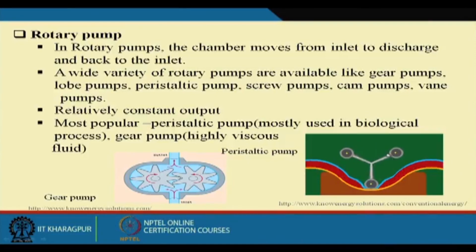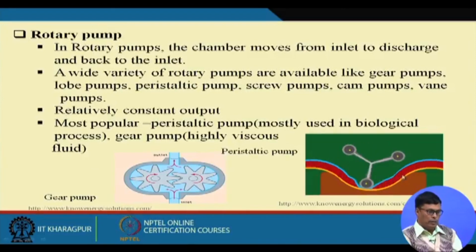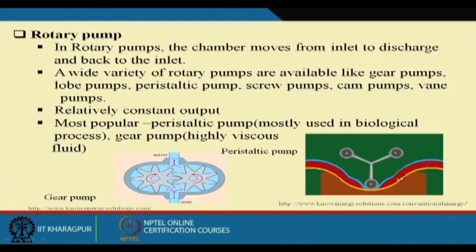Now, you can see that when this shaft is rotated like this, this roller rotates, then it drags the liquid this way. Can you see it? It drags the liquid from one end to the other. So this is how, and when you do this, all the material will remain inside the pipeline, inside the tubes. So no way will air come in contact with this liquid.